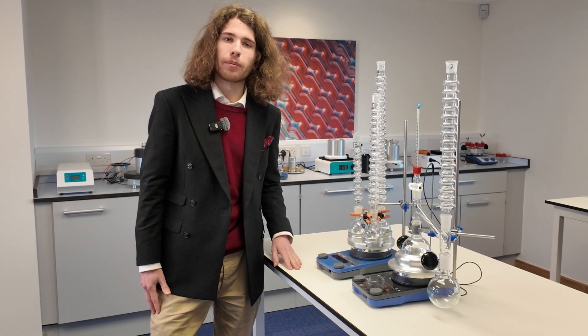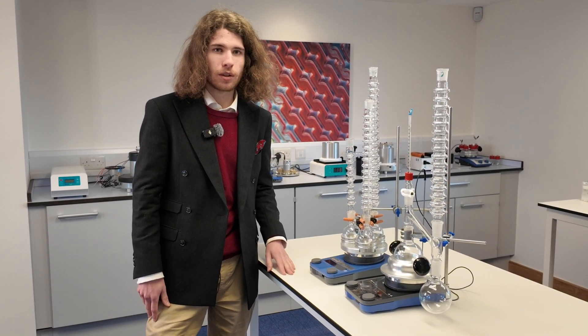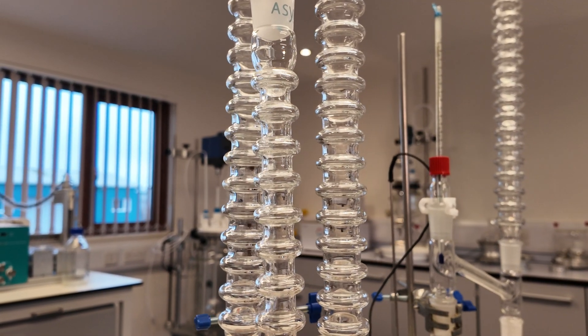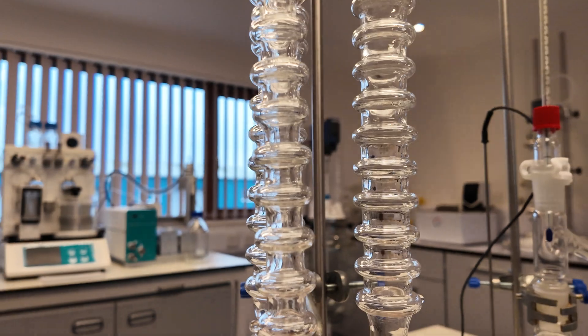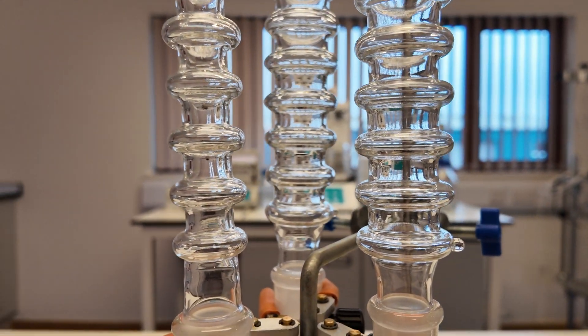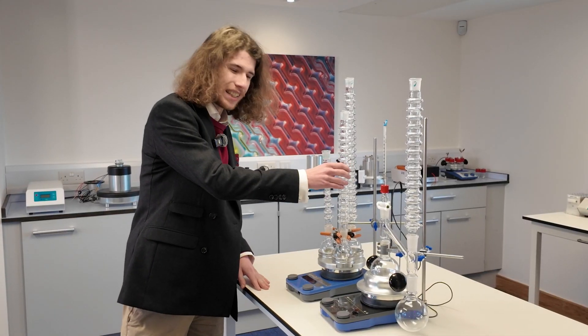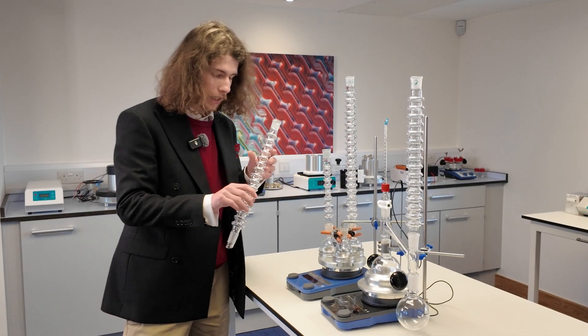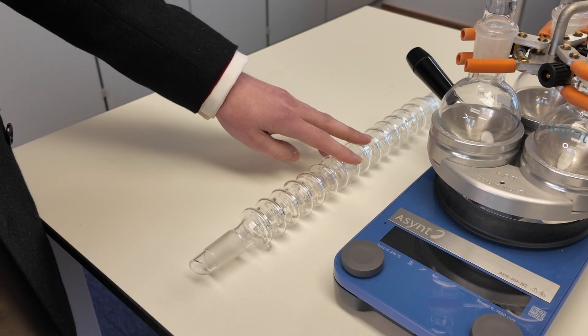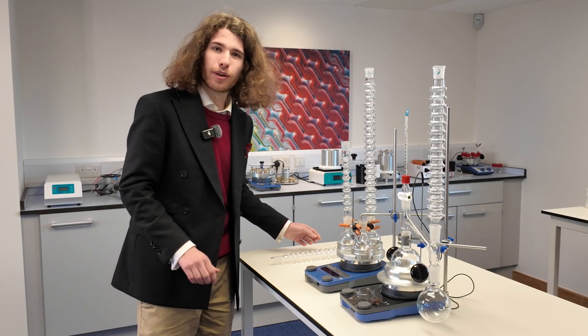All of these condensers are made of borosilicate glass, which has excellent resistance to temperature change. It can also be repaired by your local glass blower. One last small design feature that these have, which was a slightly later improvement, are the anti-roll studs. These ensure that the Condenser won't roll off your lab bench.